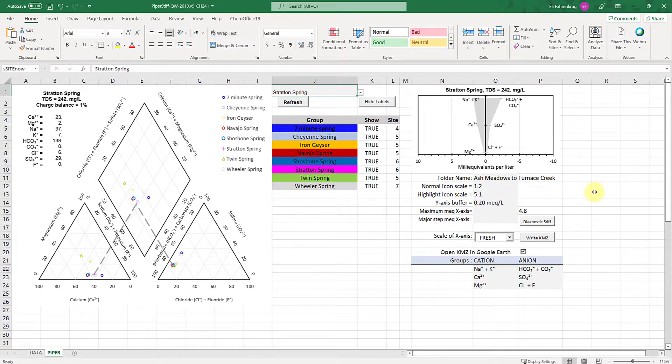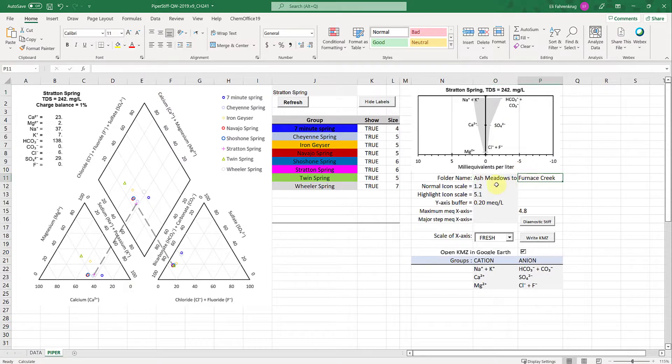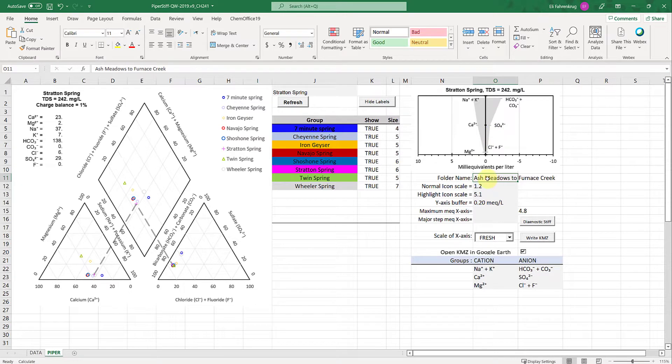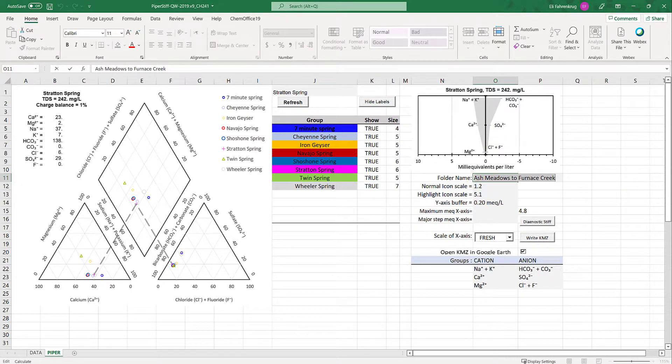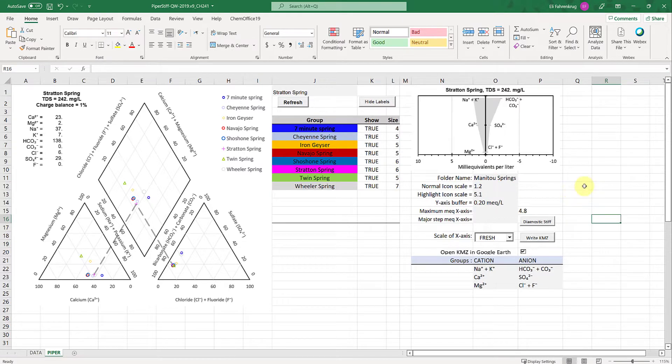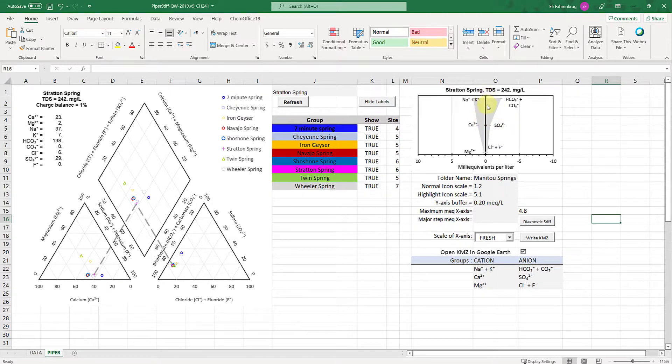It gives you a powerful tool to visualize the different geochemistries at the different sites you sampled in real time. You don't need to change anything except the folder name. If you click write kmz it will generate a folder with the kmz files. I'll call this Manitou Springs. You don't need to change these parameters—the y-axis buffer is the distance between the shapes. That doesn't need to be changed either.